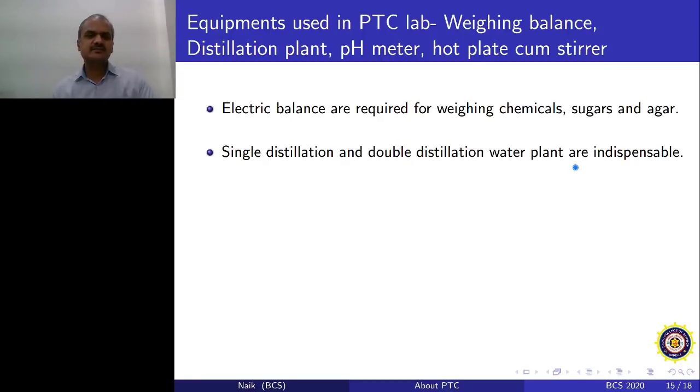If they are getting precipitated, that means your water still is not pure. It has some contaminants, because of which precipitation can occur. So if you have a single or double distillation apparatus, well and good. If you don't have it, RO can still work.